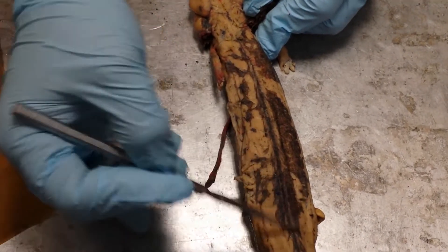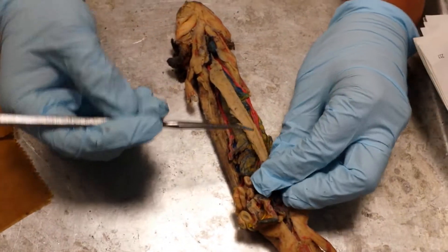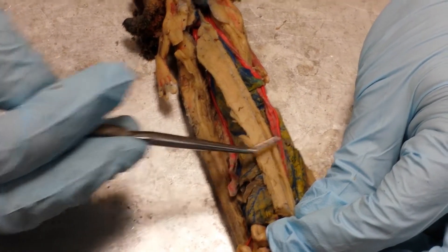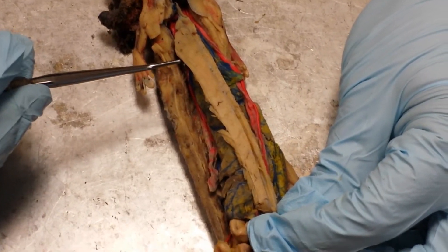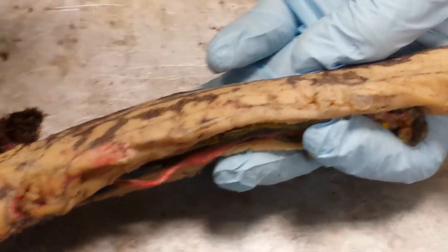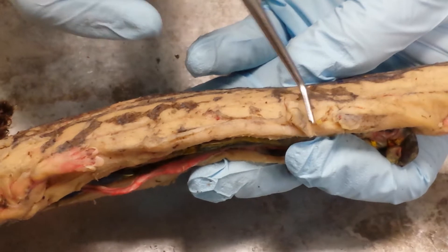The dorsalis trunchi are right here. If we flip the salamander over to the ventral side, there's the line running through the ventral midline, which is the linea alba, and the muscles just lateral to the linea alba are called the rectus abdominis muscles. If you look on the side of the salamander and find the horizontal septum, the muscles just ventral to the horizontal septum are called your oblique muscles.